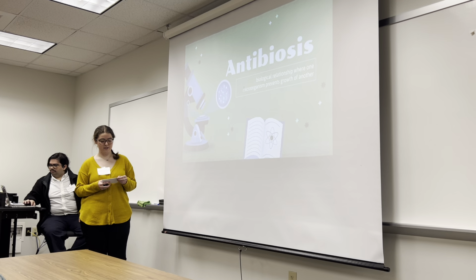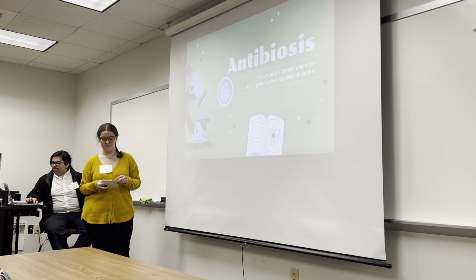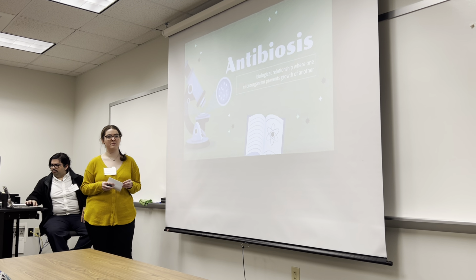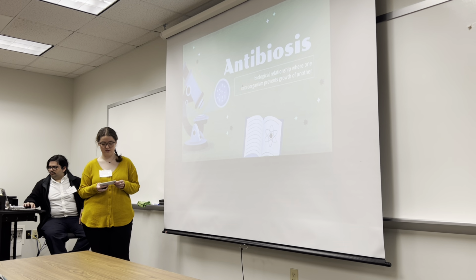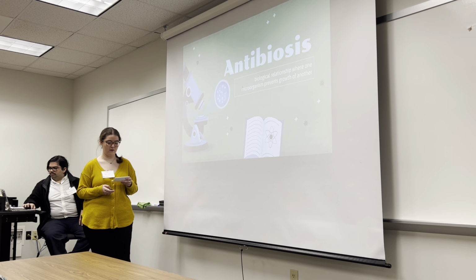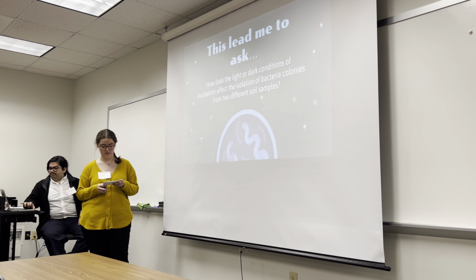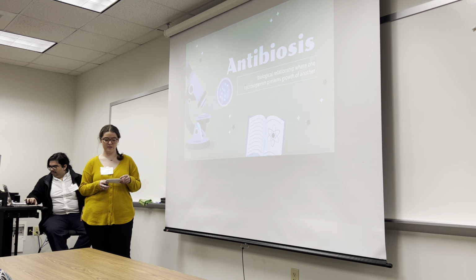And so for my conditions of isolation, I used light and dark exposure to see if it can affect the growth of certain bacteria. With light exposure, it favors photosynthetic bacteria, and with dark exposure, it mimics underground environments, so it favors heterotrophic bacteria. These conditions can shape the diversity and composition of isolated bacterial populations, and it increases the likelihood of identifying antibiotic-producing strains.